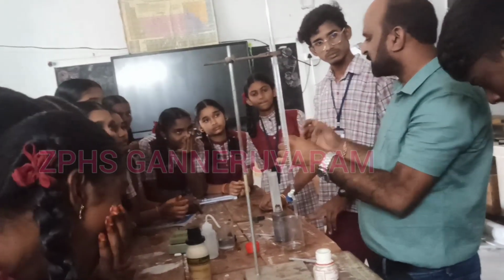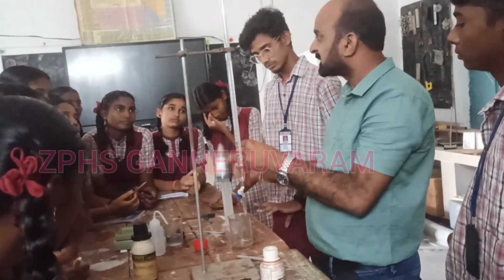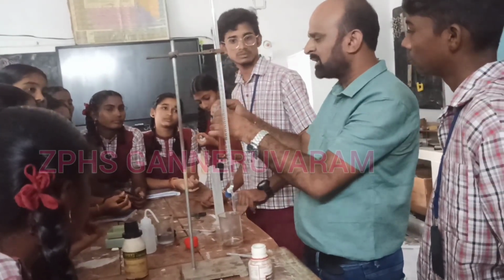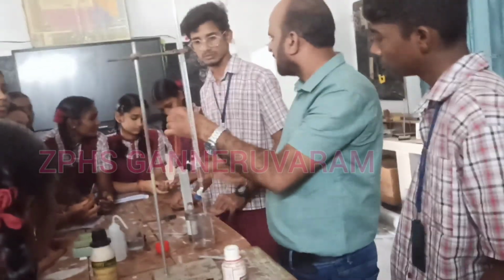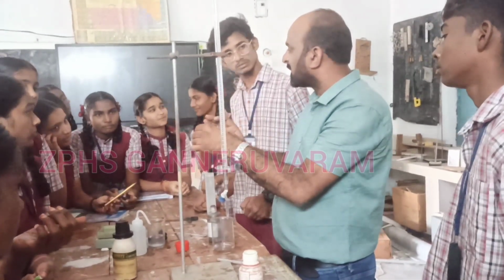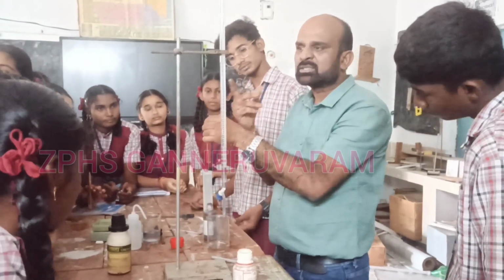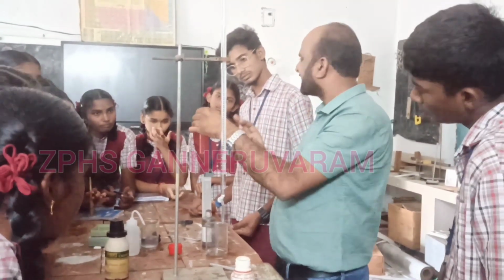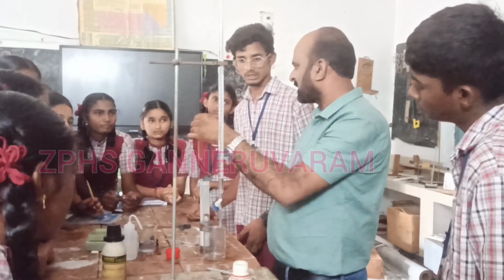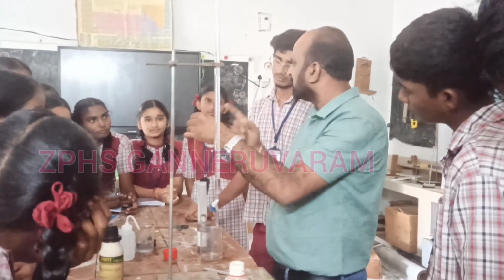So I just use the red litmus indicator. Adding the red litmus indicator to the base, it turns to blue first, and then add the HCl to this NaOH solution, neutralization takes place and it changes to red color. Understood? Because red litmus color will be red color. That's why we got red color.